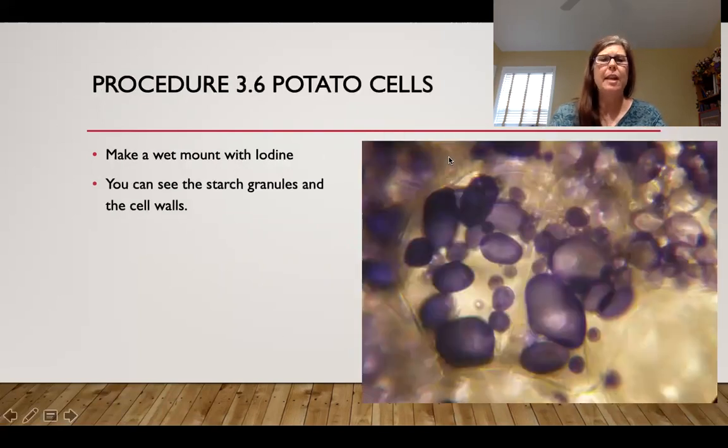And what I like to do with the potato is you make a scraping, and then what we can see is the iodine complexes with starch, and you get this black color, and that actually looks like stained glass windows. It's one of the prettier slides we do. And so we can see the starch granules inside. Here's our cell wall material.